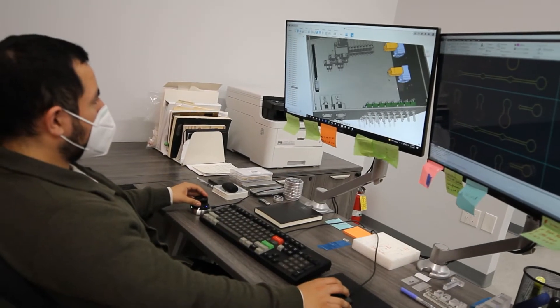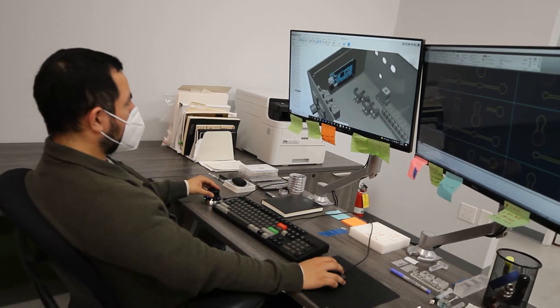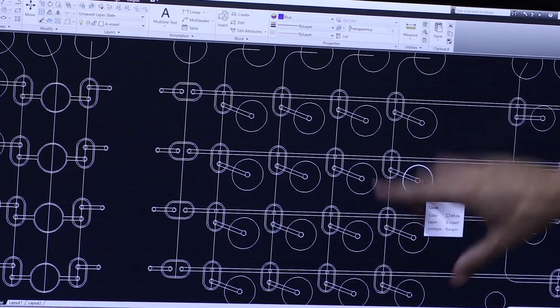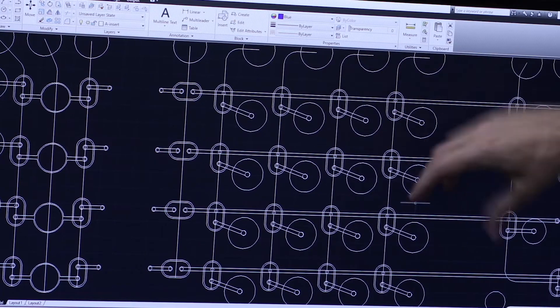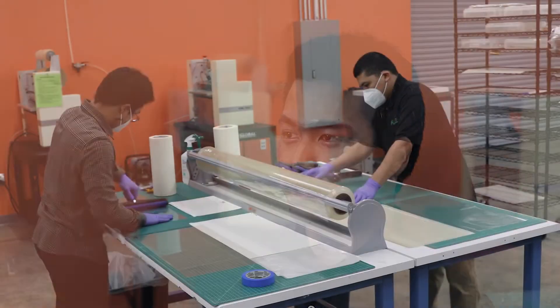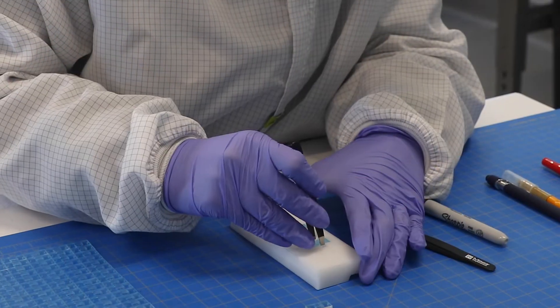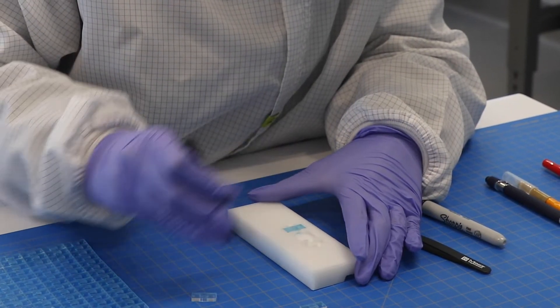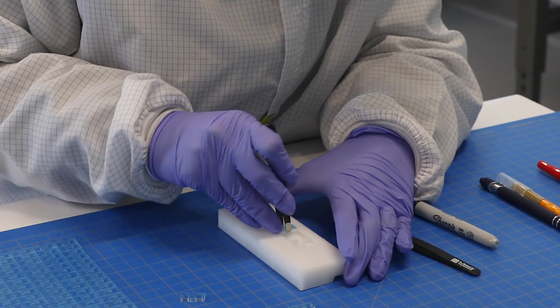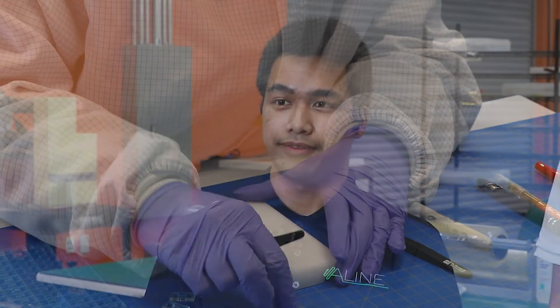What that means is that we have a wide variety of designs and parts while keeping the quantity low. To really organize this manufacturing process, we've had to establish a set of standardized work instructions. What the work instruction does is that it outlines each step of the build process starting from material prep to final post processing. It's very easy to read and follow and it allows for even the most complex builds to be comprehensible.